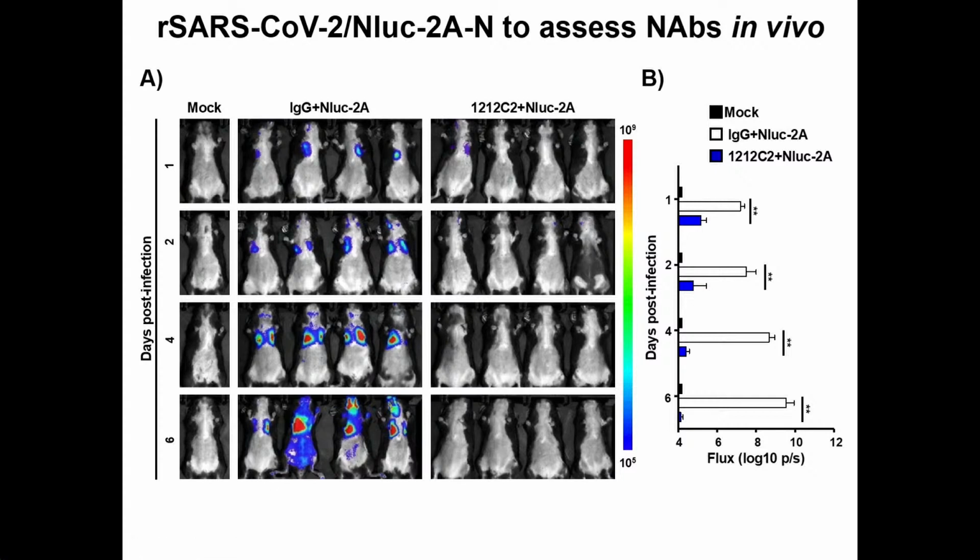So this suggests that we can now use this reporter, in this case the luciferase-expressing virus, and this in vivo imaging system to directly evaluate in vivo the ability of antibodies or antivirals to neutralize or inhibit viral infection.